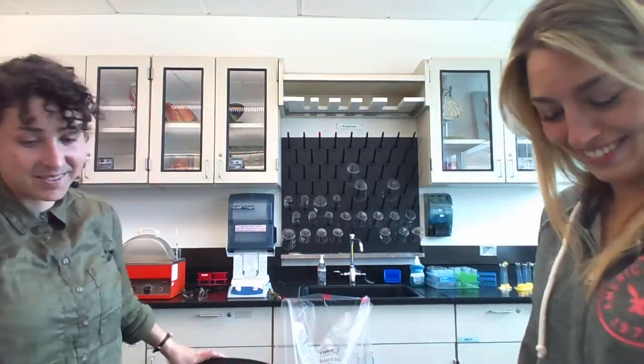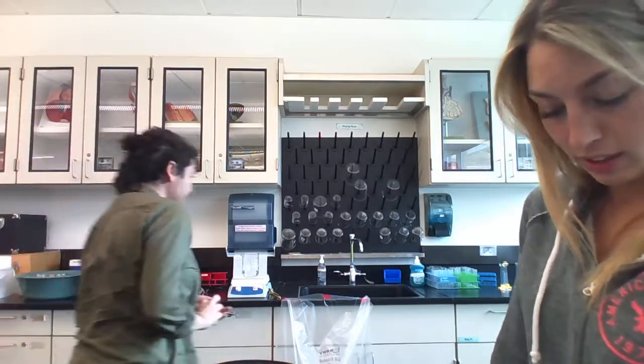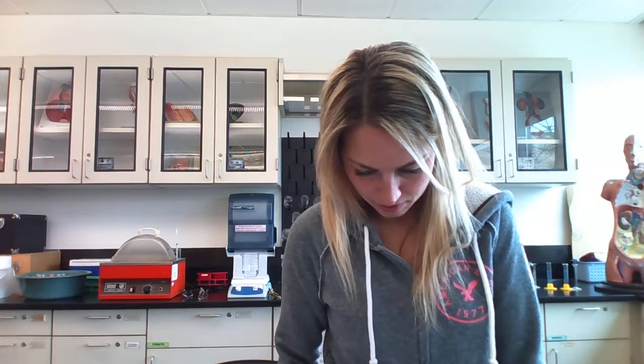Okay, so that's 112. They break things down. They speed up. Okay, that breaks down fat. So lipase is in all of them except for 2. What is this green one?